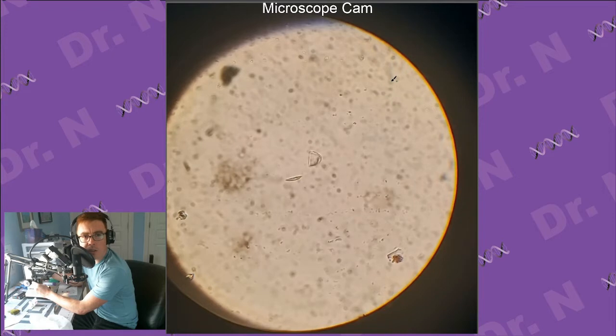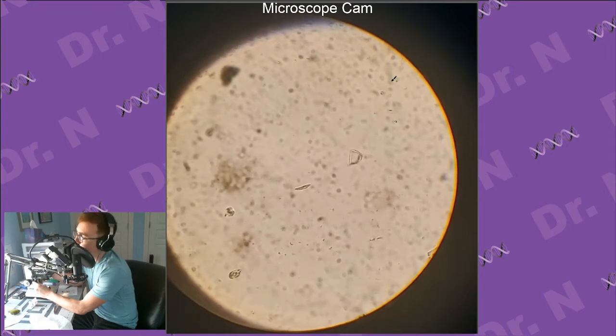So first of all, you can sort of see some little dots swimming around it. Those are bacteria, with either flagella or cilia, kind of moving through the liquid. That guy is probably some sort of paramecium. I don't have the magnification or skills to tell you what species. So it's a single-celled eukaryote. I think they're eukaryotes. Maybe don't quote me on that.